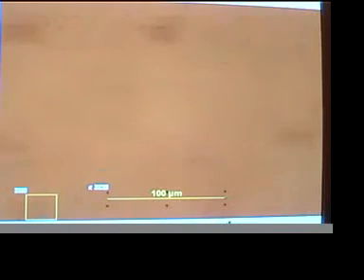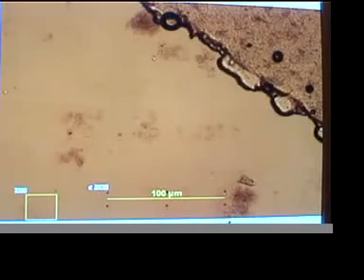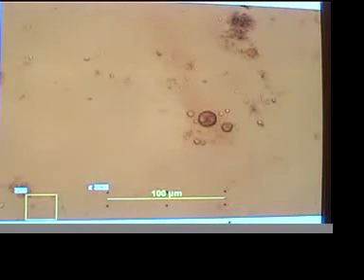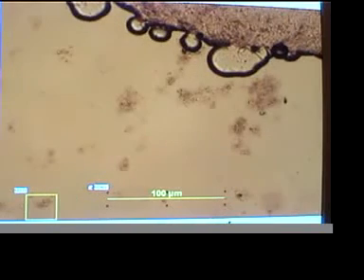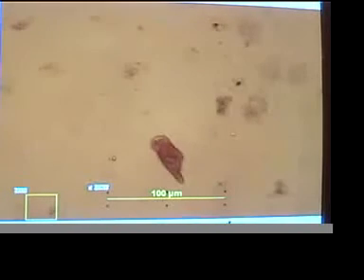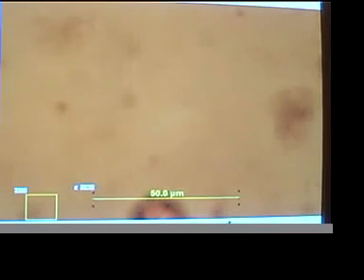Well, we missed the total disintegration earlier. Right over here. There we go. That was an organism, but the video camera wasn't ready. He burst, looked like a balloon bursting, and then right now this is kind of the same thing happening to this organism here. Let's get a close-up on that. I think it's going to be pretty interesting. It's the 10x. Let's find him before he disintegrates.